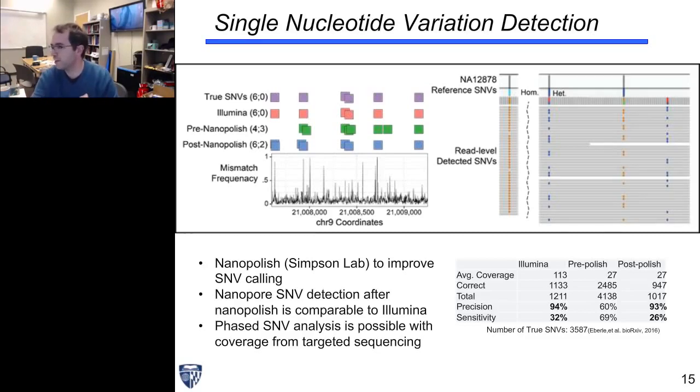So we're going back and trying to do better design of probes to make sure we really capture the region in depth. But the important aspect to realize about this is that along these 1 to 2 kb long reads, we actually are going to get phased information. So shown in the top right is an image generated from IGV, which is a sequencing visualization software. And there, what you can see is phased SNPs.